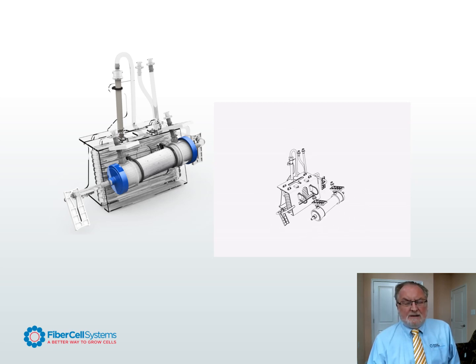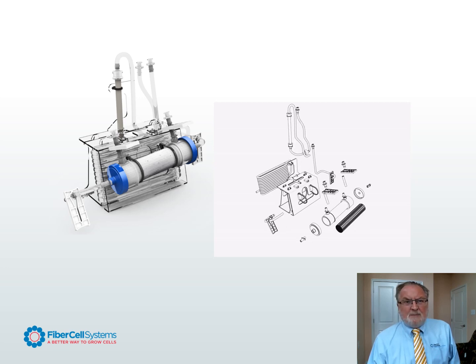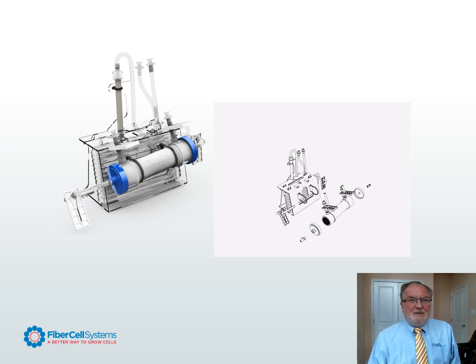That's called spalling. These plastic particles will clog the fibers. So this is why we want to utilize our positive pressure displacement pump, a frictionless pumping system, and we can generate flow rates up to around 180 mils per minute. So the media recirculates.